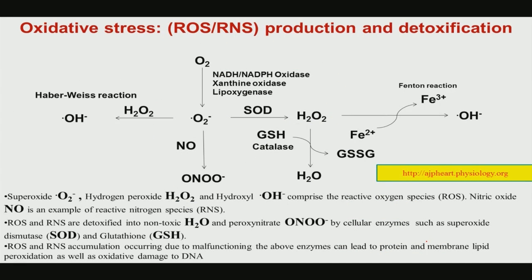Now, out of that, in the context of bactericidal property, often the presence of ROS is attributed as a reason for bacterial death. So, oxidative stress needs to be quantified, and by definition this oxidative stress is present as superoxide, hydrogen peroxide, or hydroxyl ion.